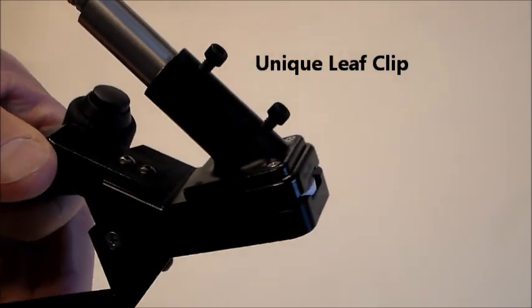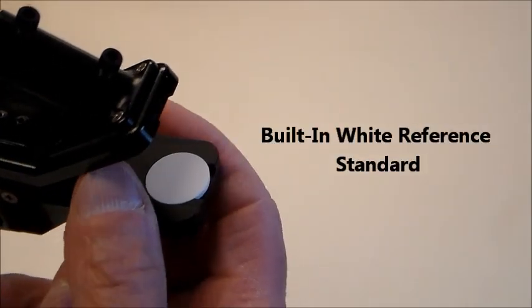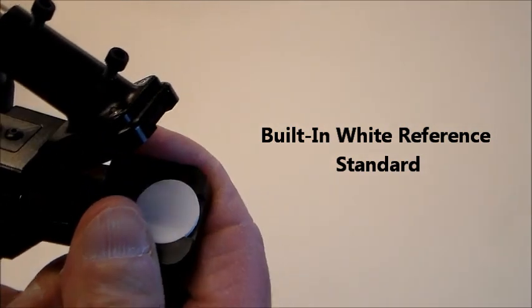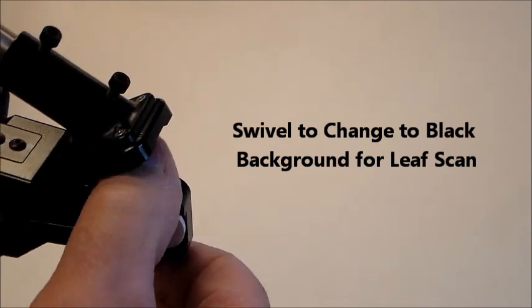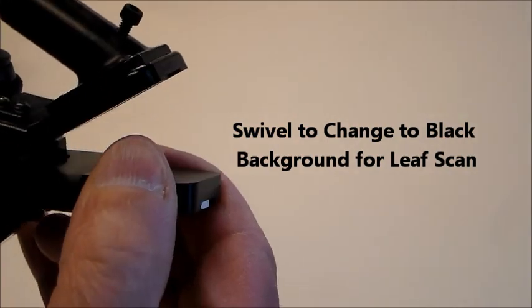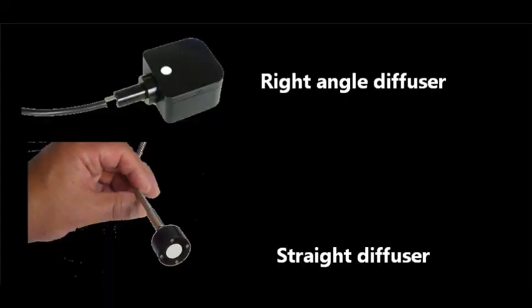Our unique leaf clip features a built-in white reference standard that swivels to provide a black background for leaf scans. Also available are right angle and straight diffusers.